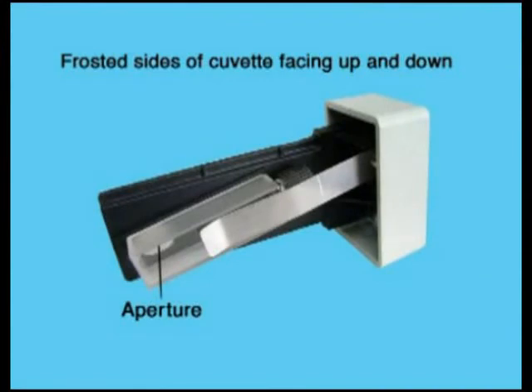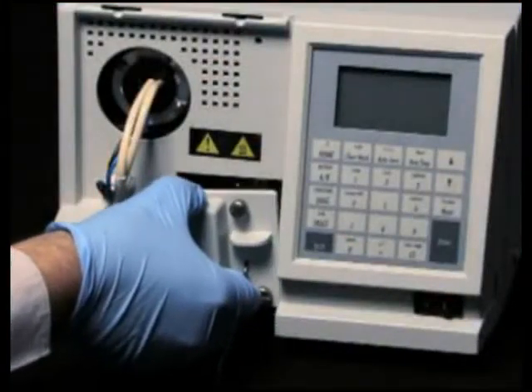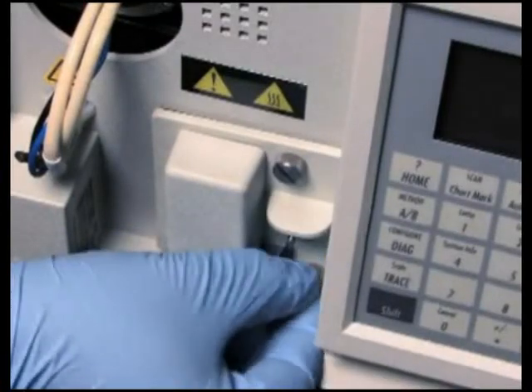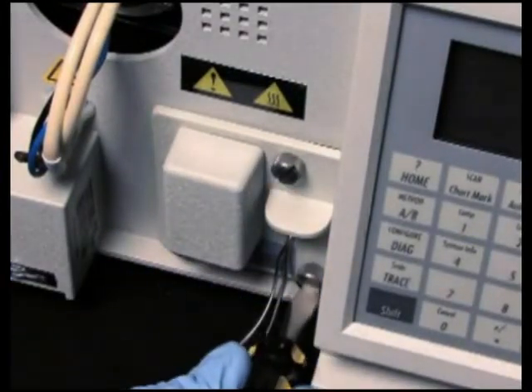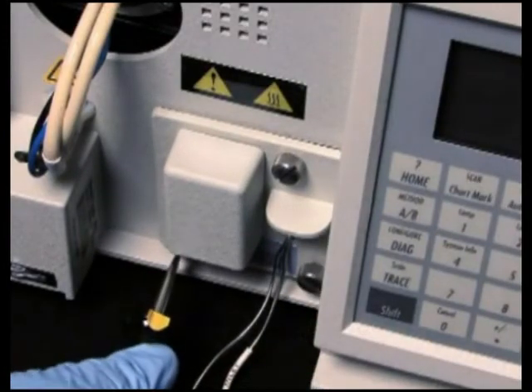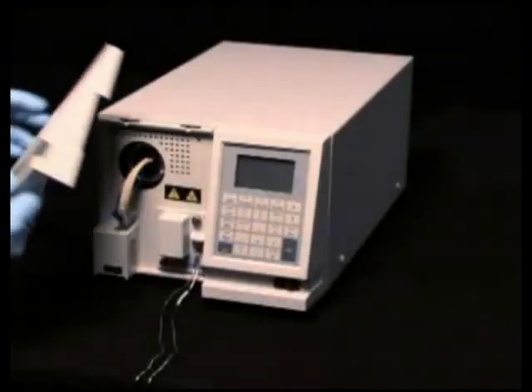If using the optional cuvette, you will need to have it installed in the cuvette holder as shown before placing the holder into the flow cell assembly. Insert the cuvette holder into the flow cell assembly, then insert the flow cell into the detector. Tighten the three captive screws to secure the flow cell in place, then replace the left front panel onto the detector.